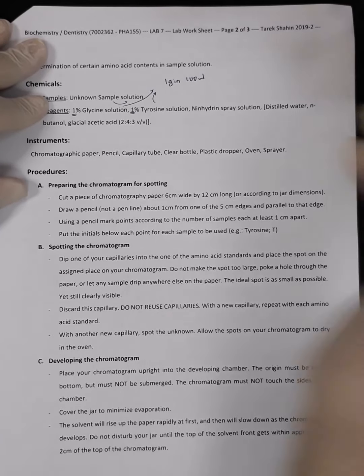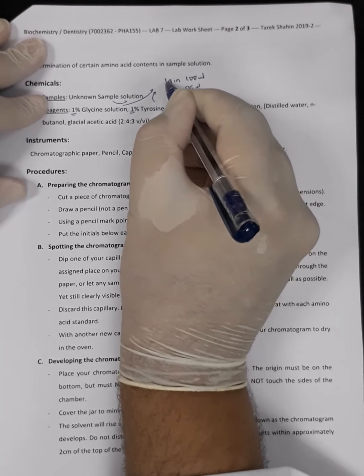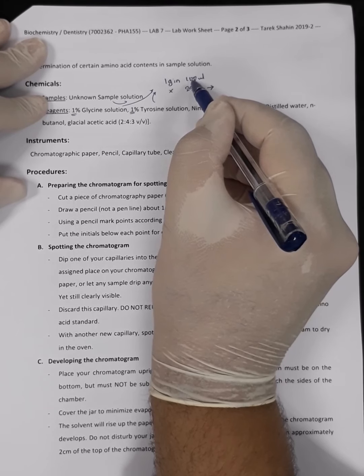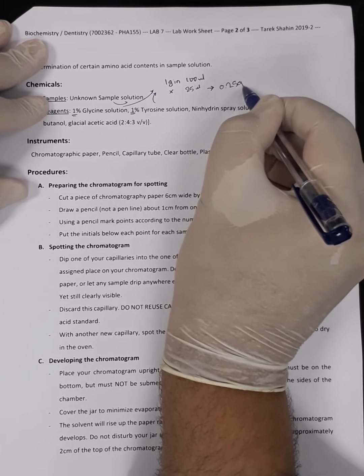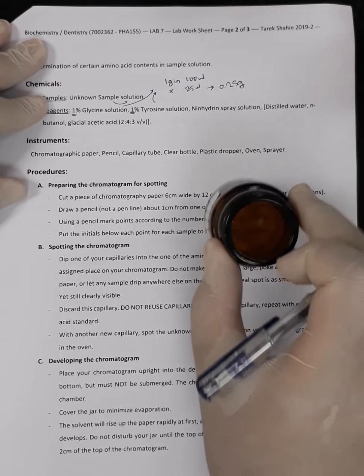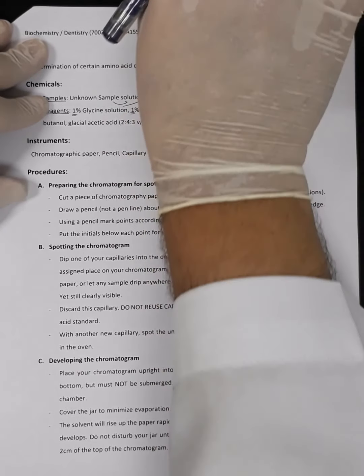So this 25 ml will require only X number of grams. By cross multiplication, multiply 1 by 25 and divide by 100. So we will take 0.25 grams of tyrosine and place it here, and then 0.25 of glycine, and the same for the sample solution.